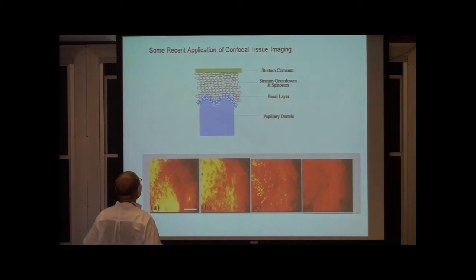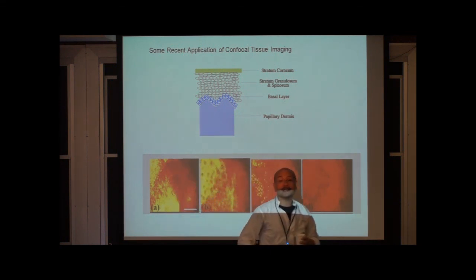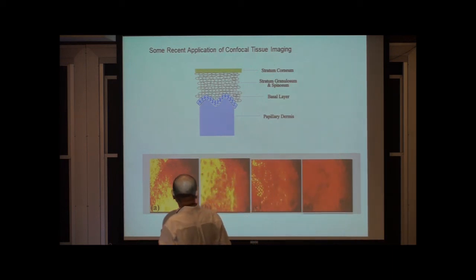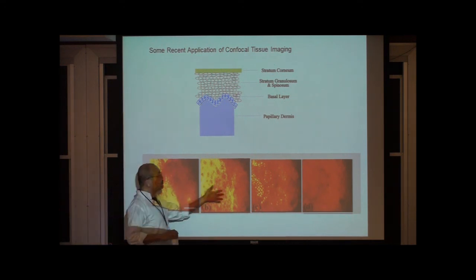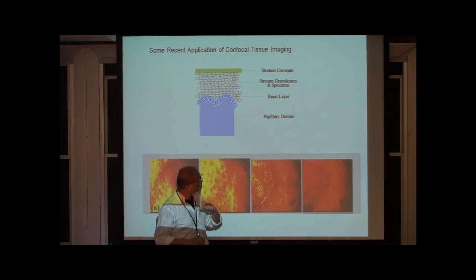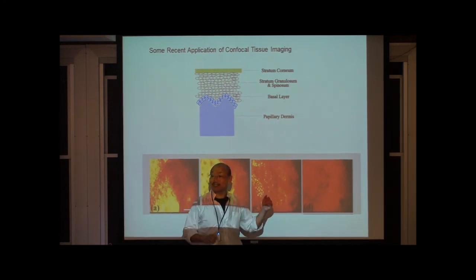In the dermis, most of it is matrix material, consisting of collagen and elastin fiber with a sparse distribution of fibroblasts. So if you use a confocal microscope and image through it, for example, when you get to the dermal layer, you can actually see this is mostly melanin caps sitting on top of the basal cells.